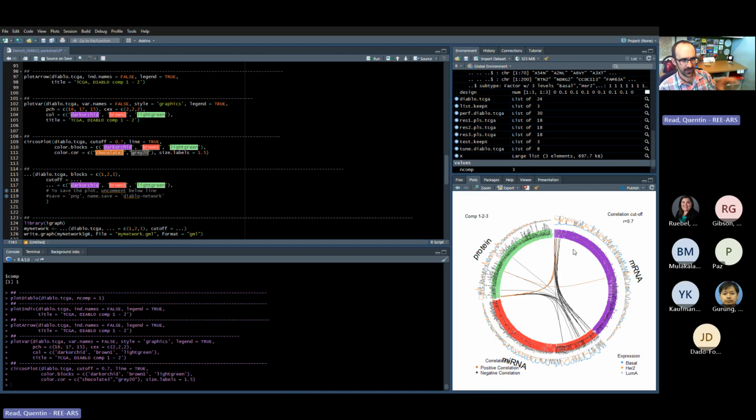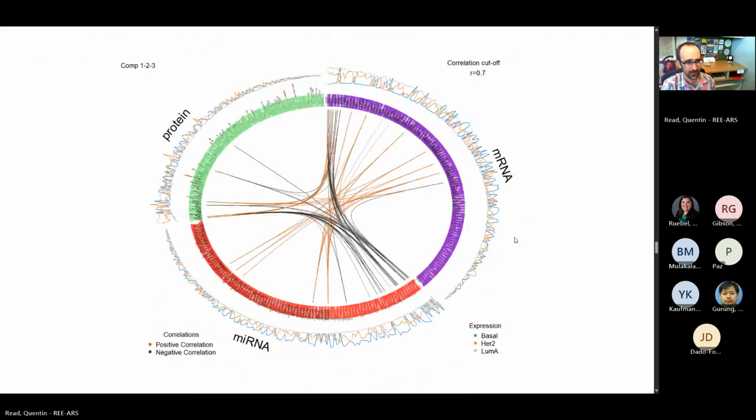Again, I think I didn't set the random seed to the same as last time, so these numbers are slightly different than what we got last time. It looks a little bit different than the plot in the notebook, which is not a great sign, I think. If changing the random seed a little bit gives you a totally different result, that's kind of a bad sign for the overall validity of these results. But again, this is a very small example data set with not too many samples.